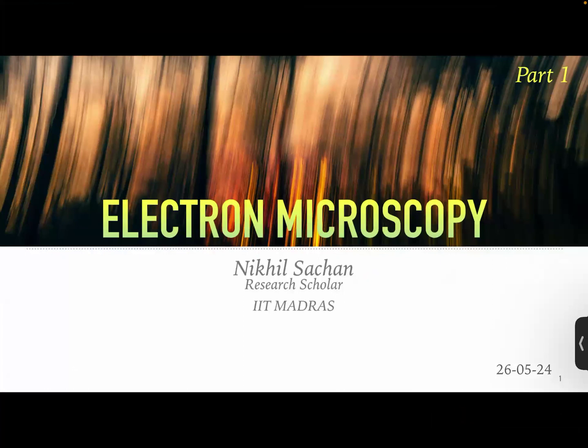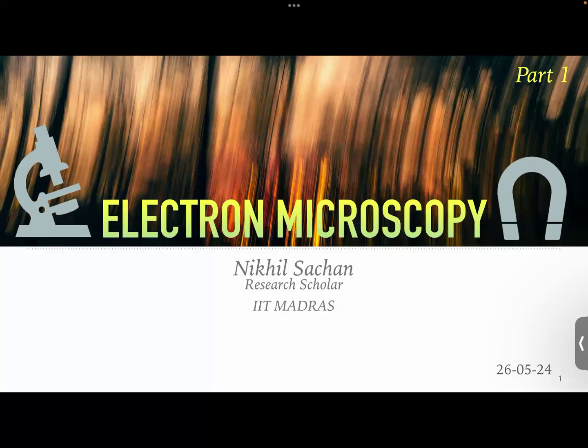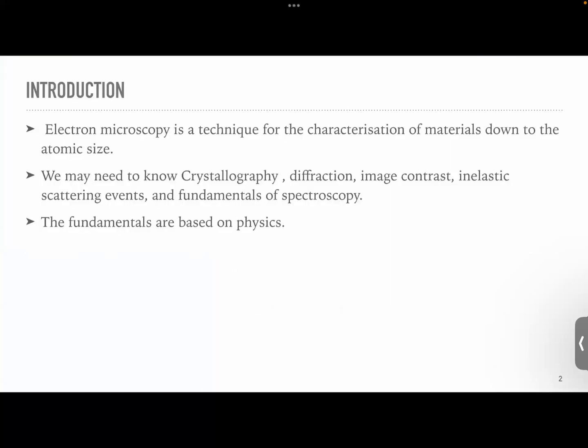Today I am going to talk about electron microscopy, which is a very good technique to characterize our sample and to know more about our sample to the atomic size. So this is part one. In part one, I will give basic fundamental ideas about microscopy and what type of microscopy we can use in a practical way. In the second part, I will talk about the instrumentation, and in the third part, I will talk about different types of detectors and the analysis, because in some types of microscopy you cannot get straightforward images, so analysis is required. So today I am talking about the basic concepts and fundamentals of microscopy. Electron microscopy is very good if we are trying to know our material down to the atomic size.